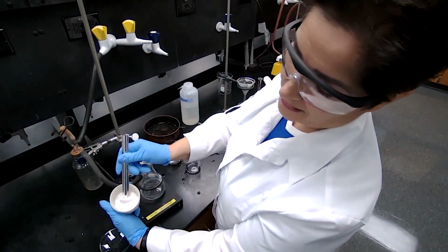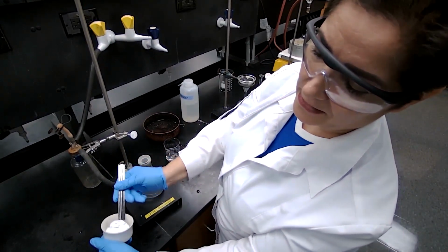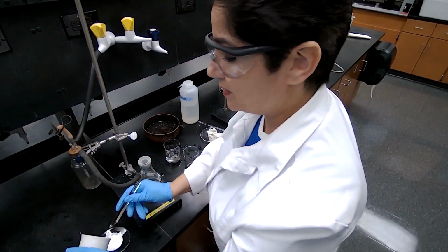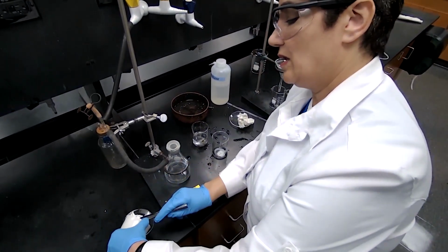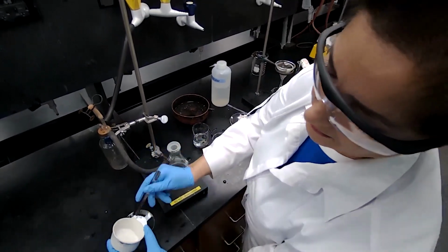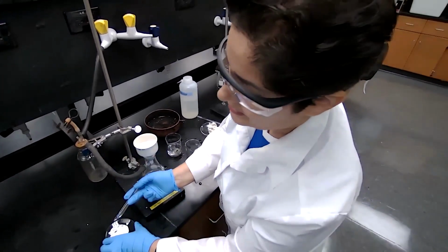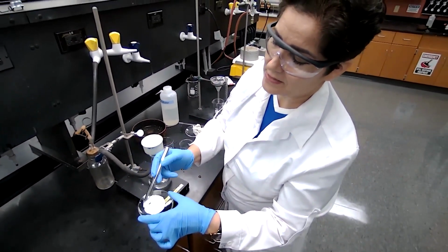Sometimes you slide the spatula underneath the paper and transfer it. Because the paper is pre-weighed already, there is no right or wrong way, as long as you transfer the paper and all of the crystals into the watch glass.